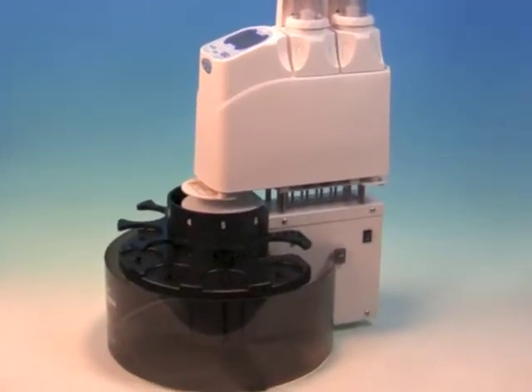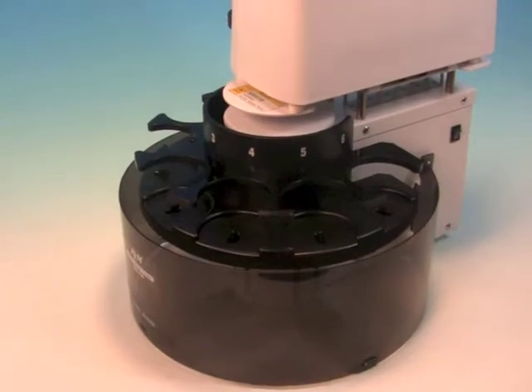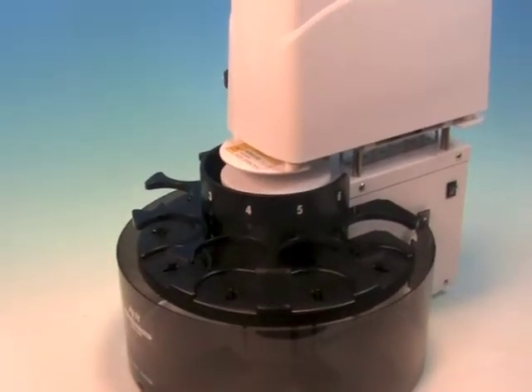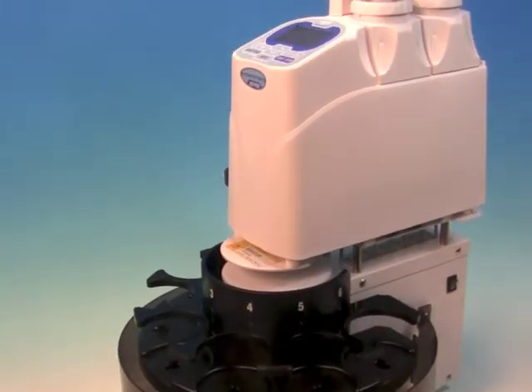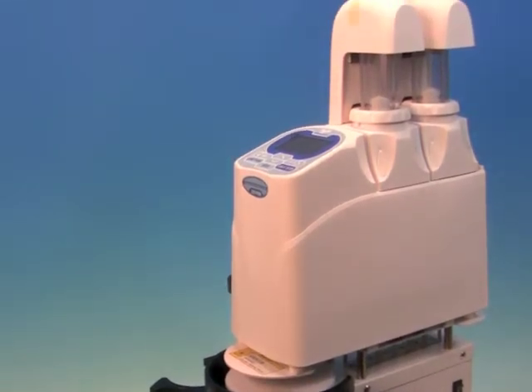The complete configuration, when coupled with the sample changer and software, as well as the additional burette capacity, make this titration system very capable.